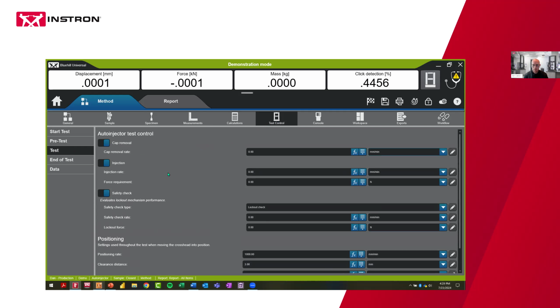And it's something that, again, we're trying to make our auto injector users' lives easier, where in the past we have been shipping these systems, but we were using normal test profiler methods, and they got very unwieldy, and it was a burden for users to figure out the complexity of those methods and how to set it up in all the different steps and trigger all the different devices to essentially do these things.